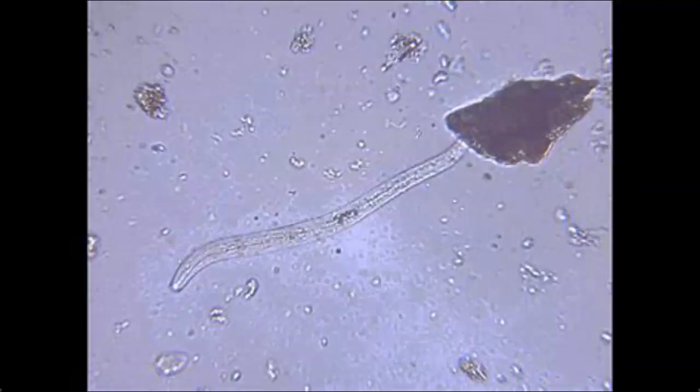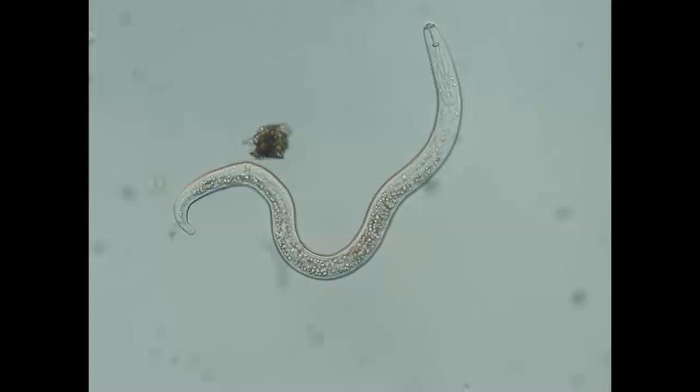A fungal eating nematode doesn't have a mouth — it has what looks like a spear. Under the microscope it just looks like a line. They use this spear to puncture the fungi and suck out the inside. These are actually good; they're not really killing the fungi totally, it just cycles nutrients. The third type is a root-eating nematode — these are the bad guys. They look very similar to the fungal nematodes except they have a little bulb on the inside of that spear. This bulb lets them push hard into the root, since a root is much harder than fungi. Just look for that bulb at the end of the spear.